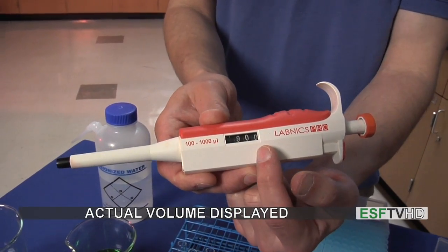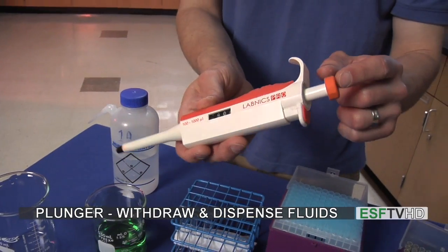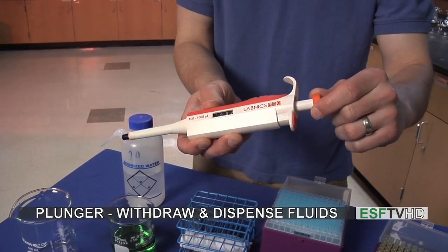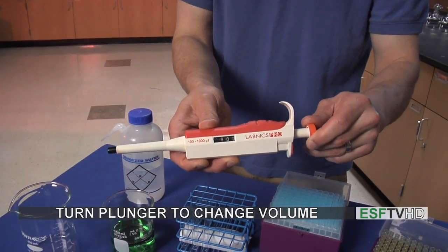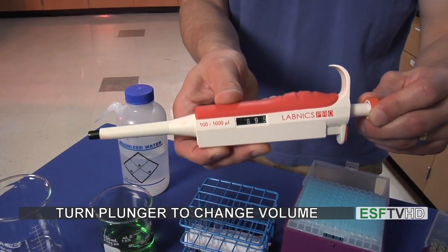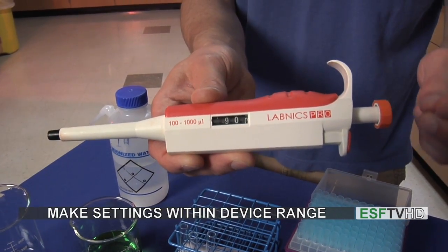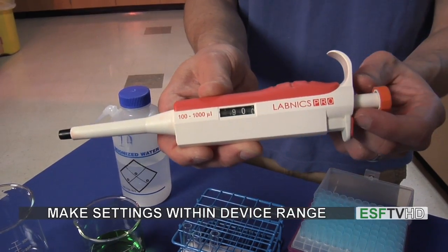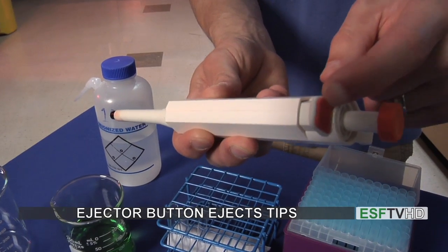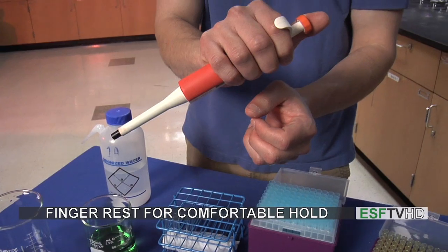We have the actual volume which is going to be dispensed. The other parts of the micropipette involve the actual plunger, which withdraws and dispenses solution. You can also turn that plunger to change the volume. I'm going to change it so it will read 900 microliters. You can move it back and forth to get to the volume you need, and never go below 100 or above 1,000 microliters. We also have an ejector button, which ejects the tip of our pipette, and a finger rest so we can comfortably hold the pipette in our hand.